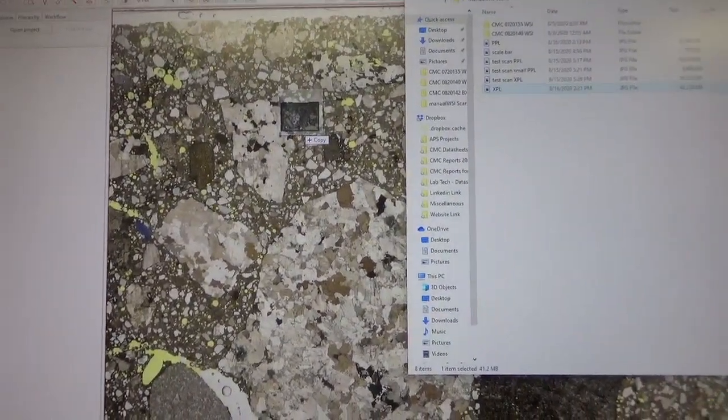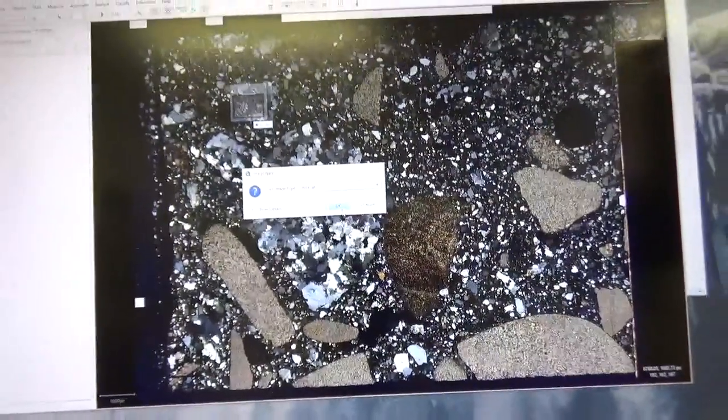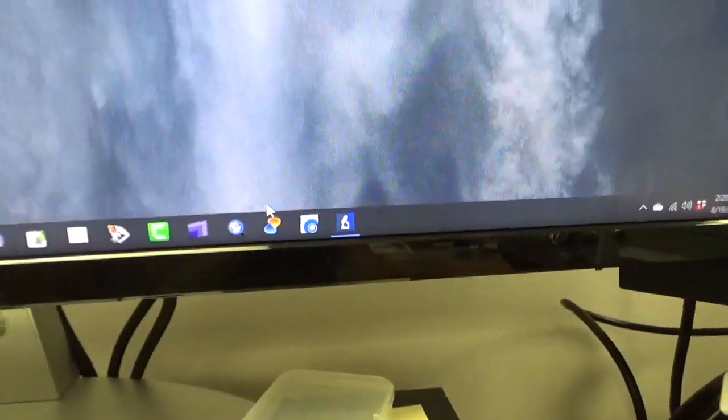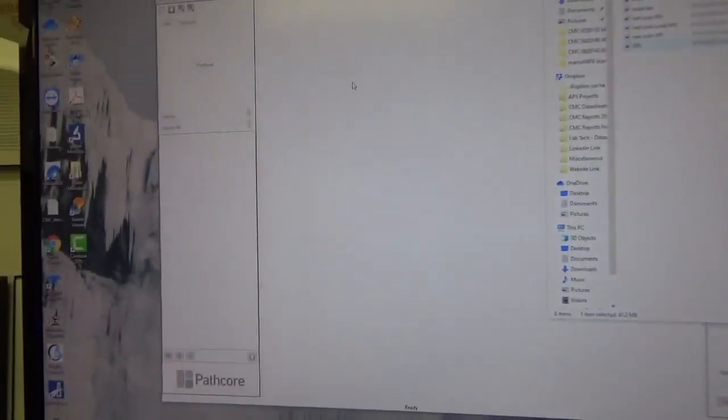And now let me show you the cross polar one. You just bring the cross polar one on top of that. Well, why not show you the cross polar image in the other viewer? Here it is. Let's close this one. Open the Sedeen Viewer, the other whole slide viewer, and then again you drag the cross polar one into the viewer from PathCore.